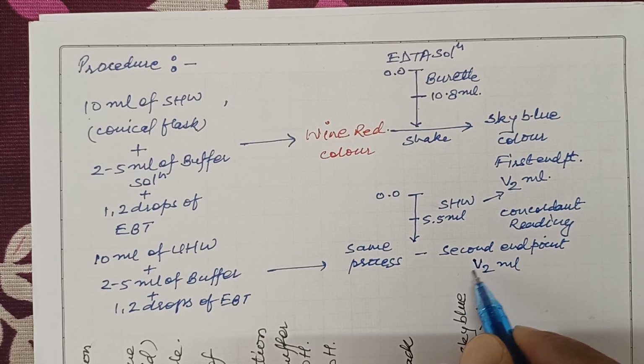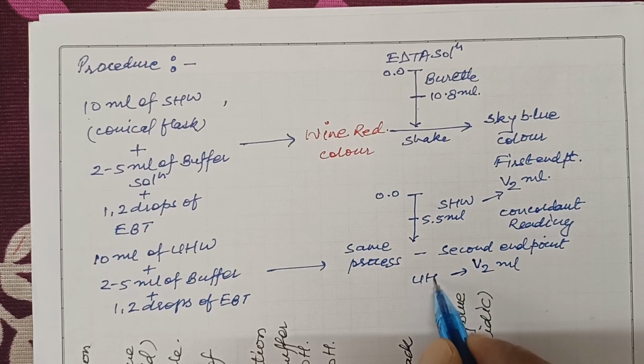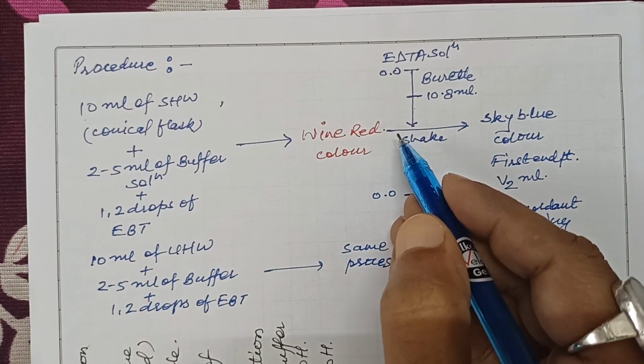We get the second reading with the unknown hard water. So this is the procedure.